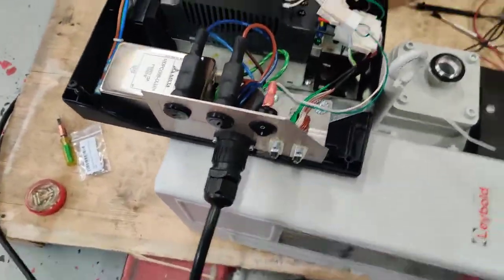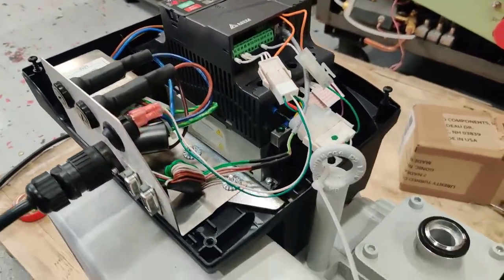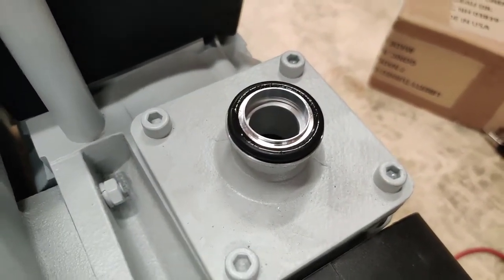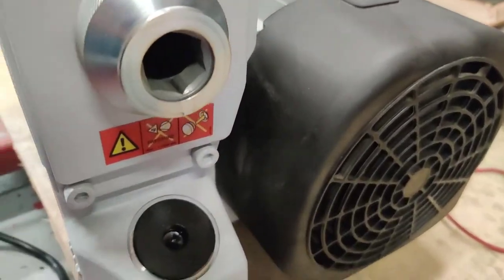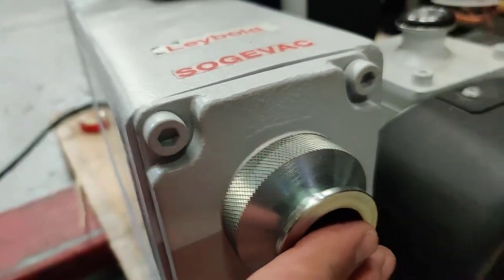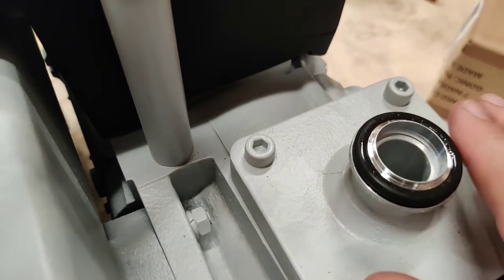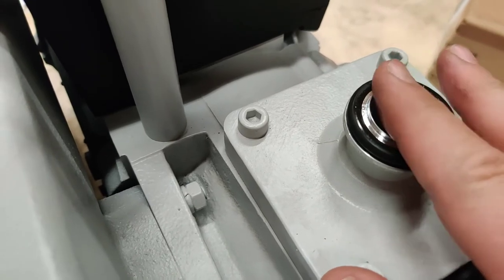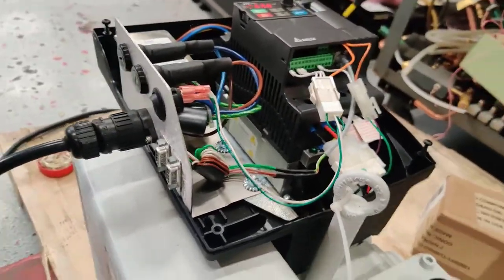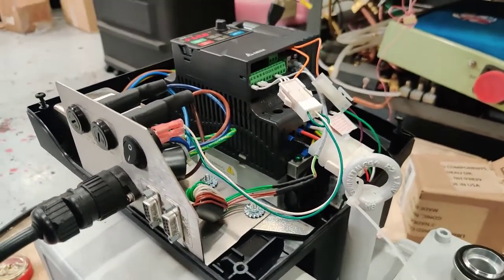So let's start it up right here. Let's see. There you go — one pump running. Now the pump is working brand new.